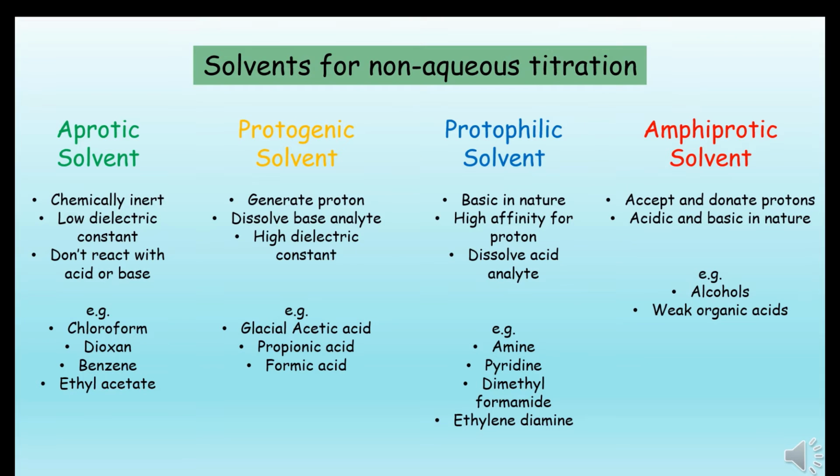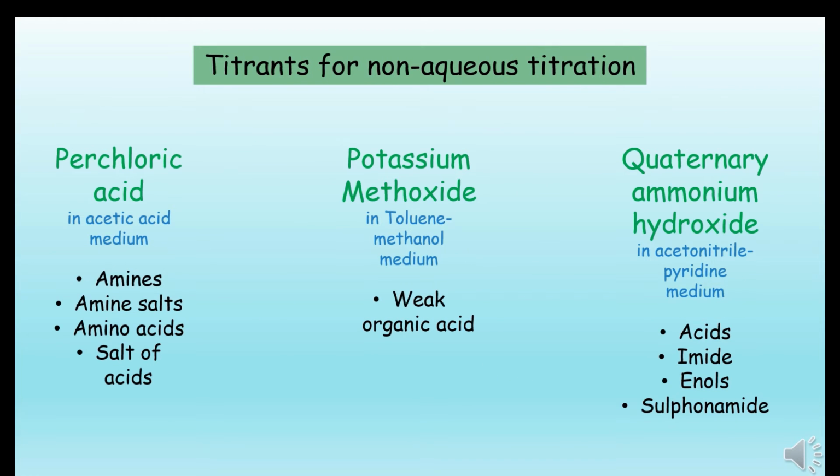Here a number of solvents are listed which can be used in non-aqueous titration. Check it out. These are some examples of titrants which can be used in non-aqueous titration.